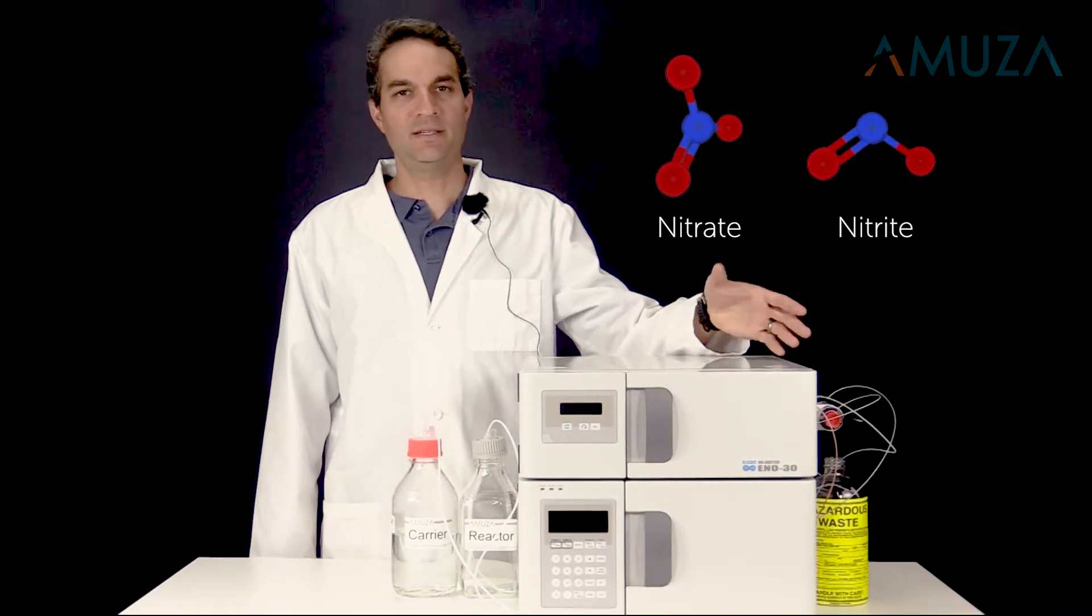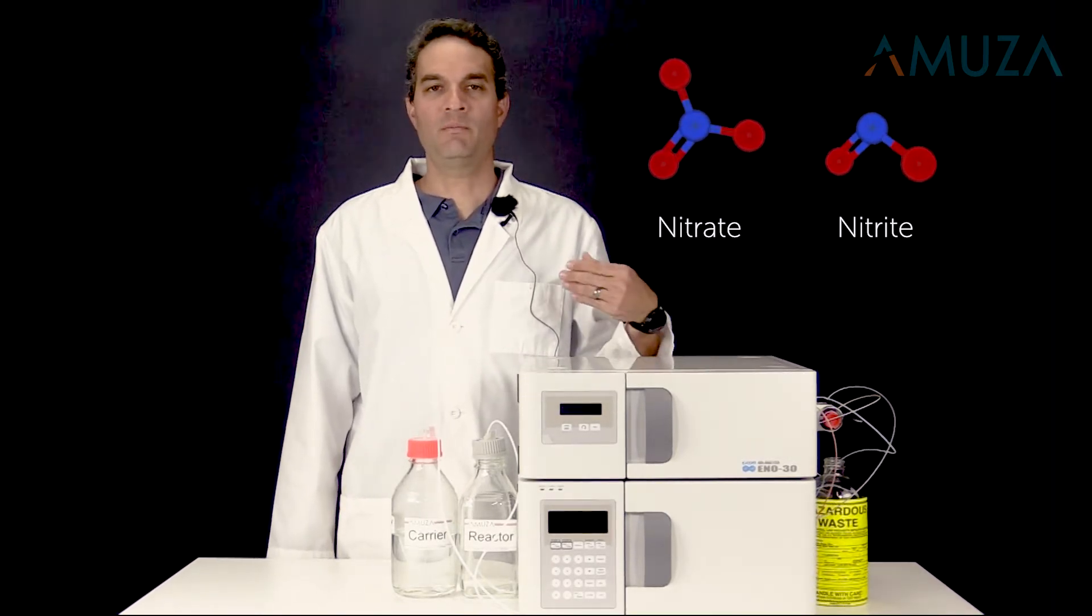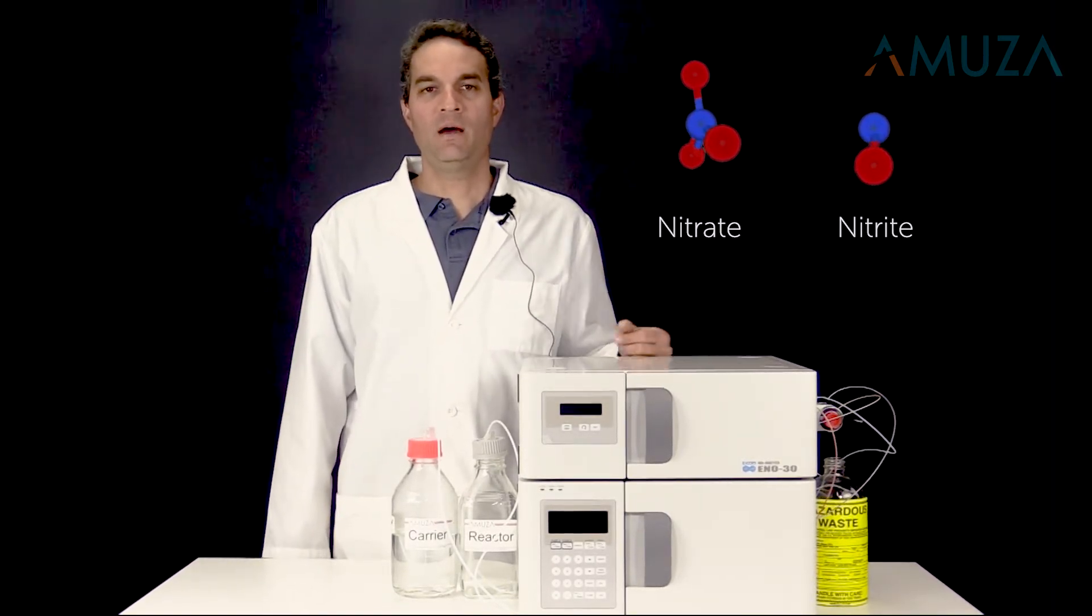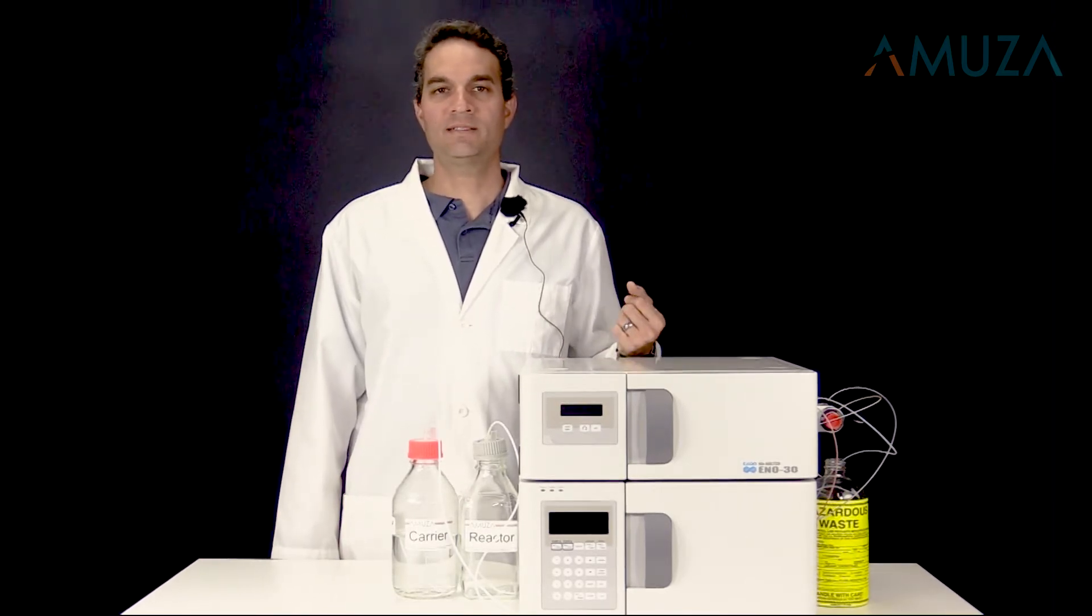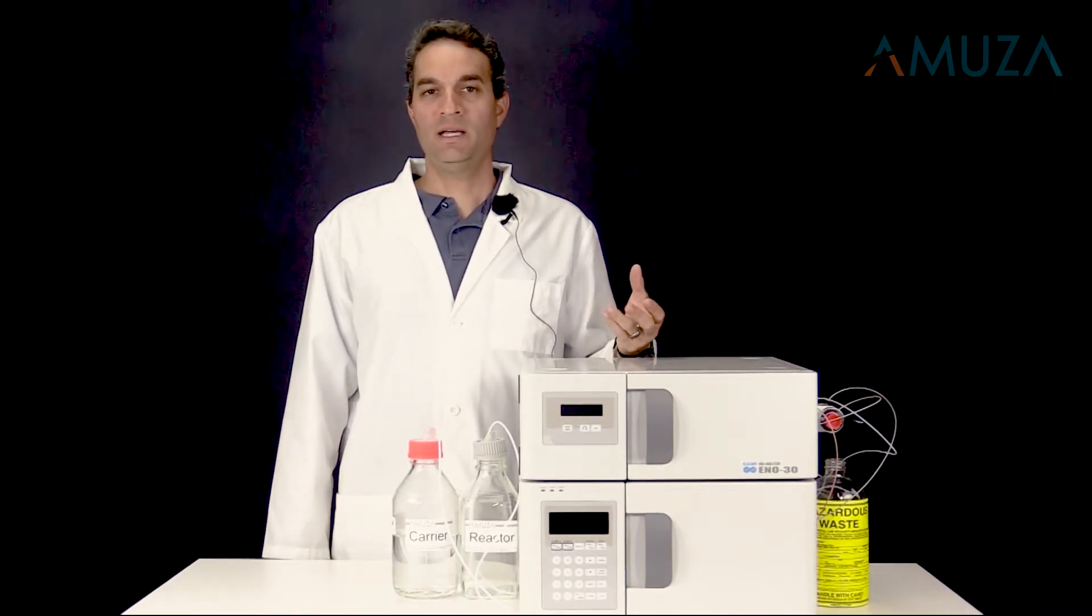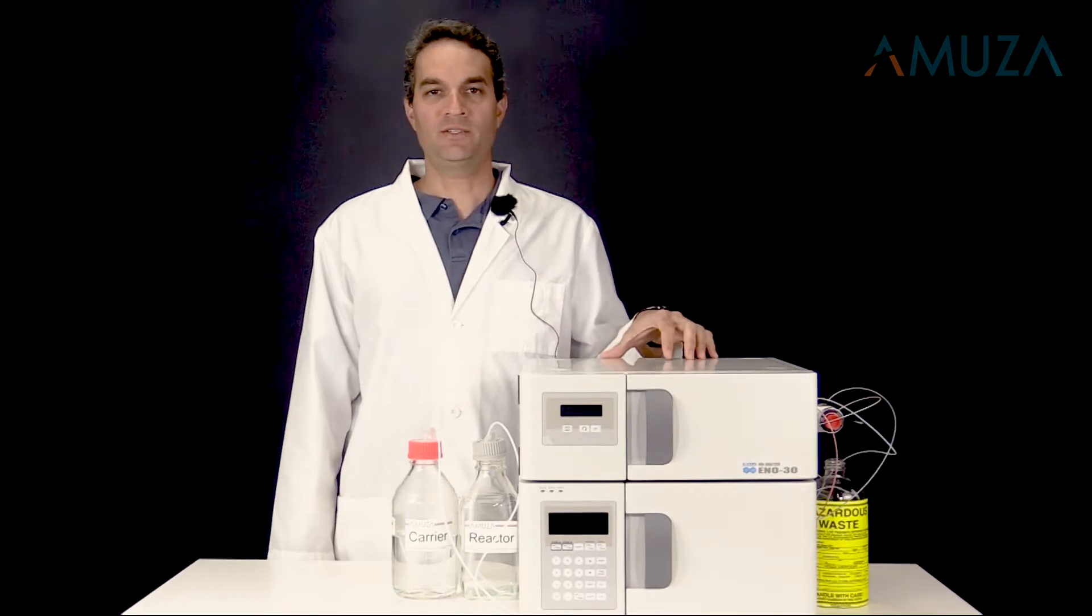The ENO-30 is a uniquely designed system that combines HPLC with a colorimetric assay optimized for fast and highly sensitive quantitative analysis of nitrate and nitrite.